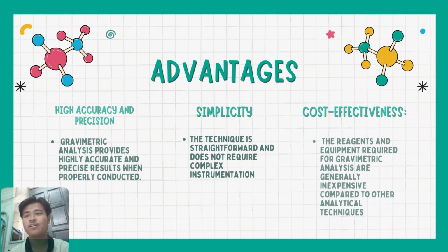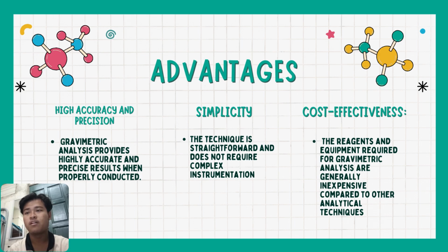Okay, let's continue with the advantages of this method. The first one is high accuracy and precision. Gravimetric analysis provides highly accurate and precise results when properly conducted. This is because the method relies on measurements of mass, which can be done with great precision.